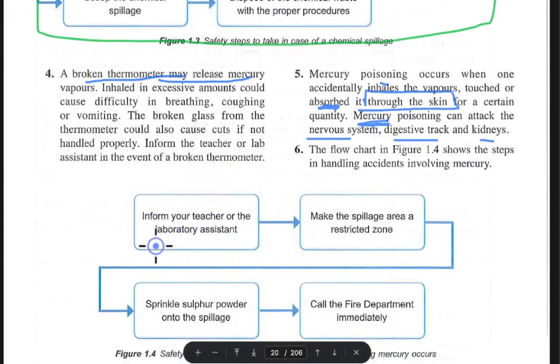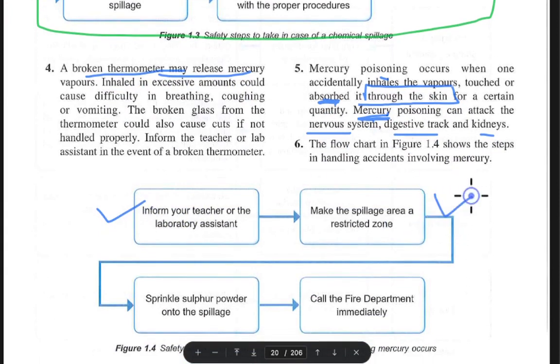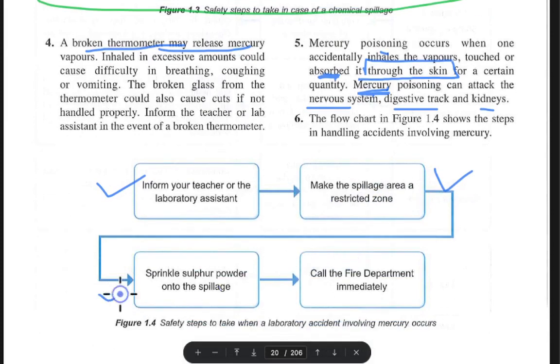Okay, inform the teacher. Make a spillage area. Sprinkle sulfur powder onto the spillage. Here it says sulfur powder, because it involves mercury. If you don't have it, then maybe you can just use sand, should be okay, because you don't want it to flow. Call the fire department. What? Need to call even the fire department?